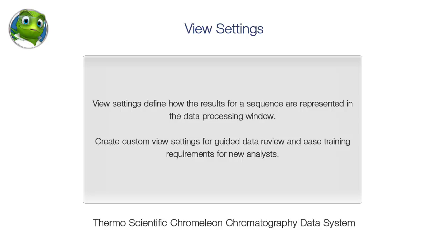View settings define how the results for a sequence are represented in the data processing window. Create custom view settings for guided data review and ease training requirements for new analysts.